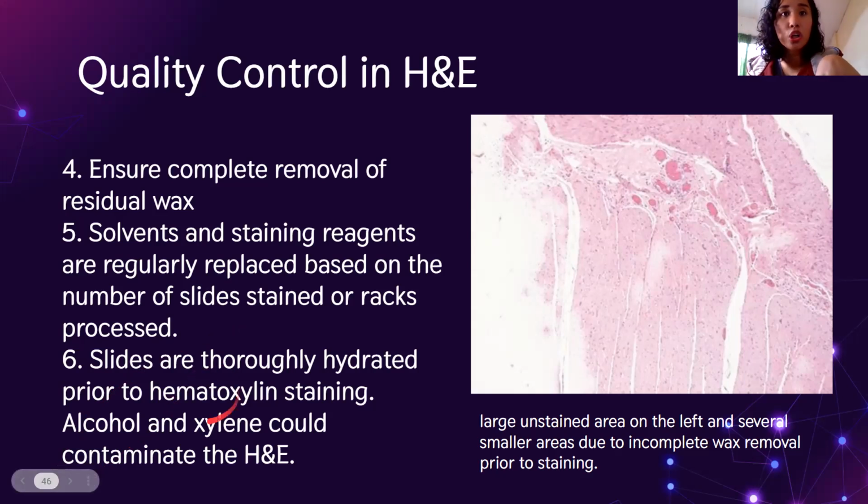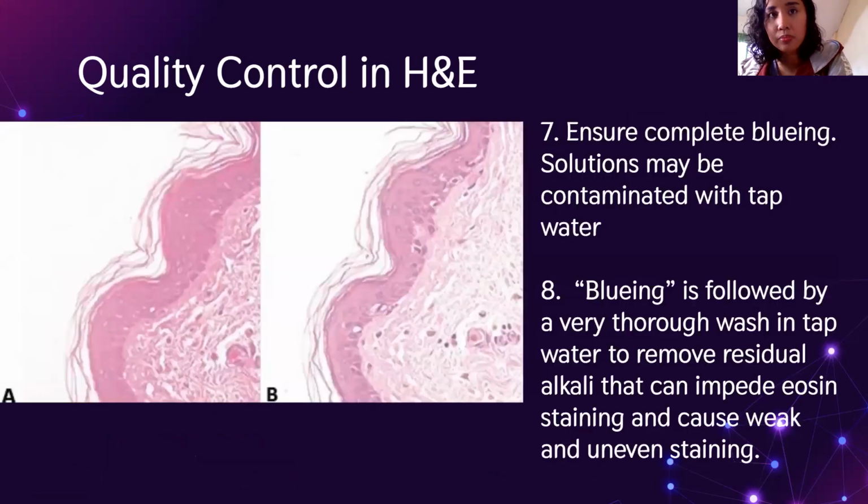And slides are thoroughly hydrated prior to hematoxylin. Yan. So, prepare it properly. So, kailangan you have exposed it to xylene and descending grade of alcohol. Yan. So, be careful lang because your alcohol and xylene can contaminate your stains. So, you have to drain it properly. At kung automated naman, walang problema.